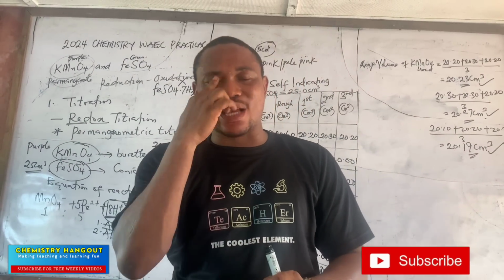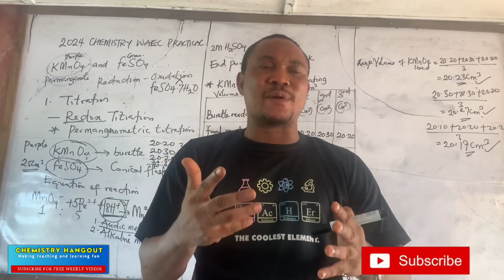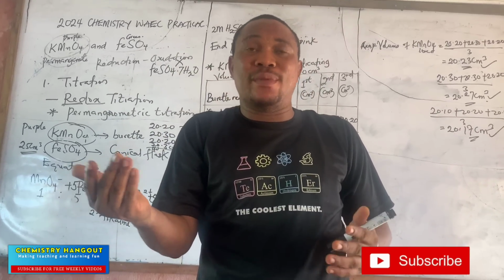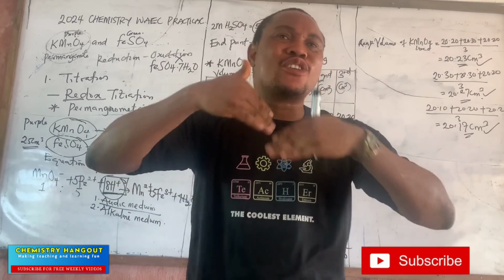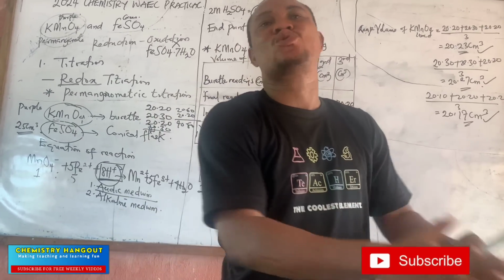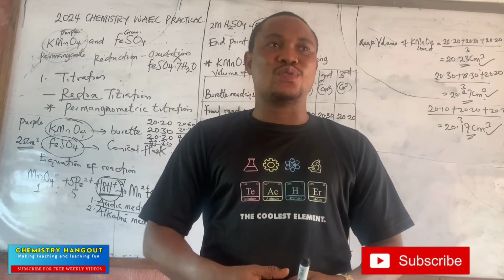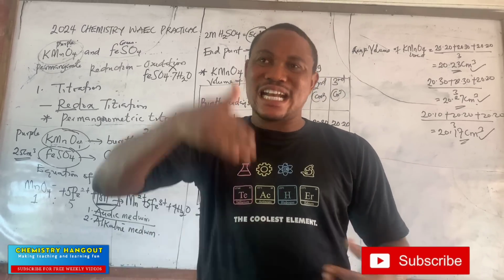So please, for teachers, I want to beg us, let's do our work, do the practical with the students, conclude on the titre value we are using on that day, probably if you are permitted to tell them, and on that day let us use that same titre value. So don't let us always look for titre value to suit the question. It shows that we have not really done our job as teachers. So please, very, very important, do pre-practical with the student, show them how this thing is going to look like, and you know your titre value already, let them practice too.